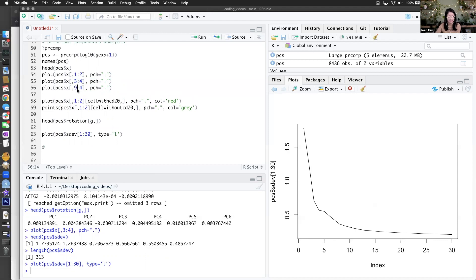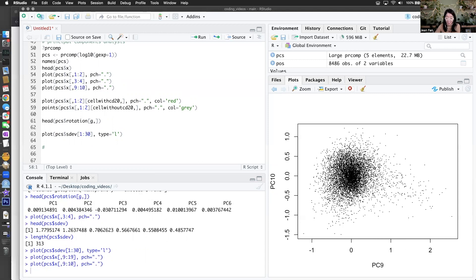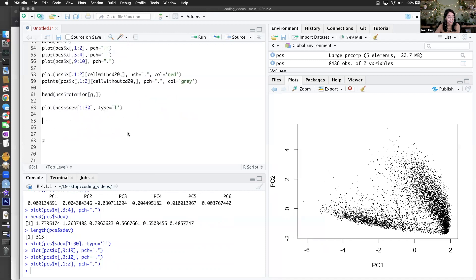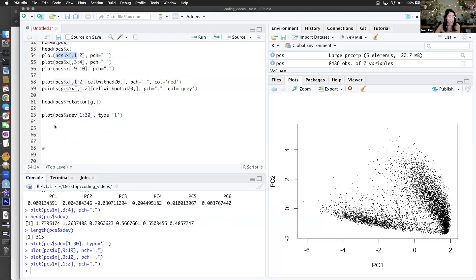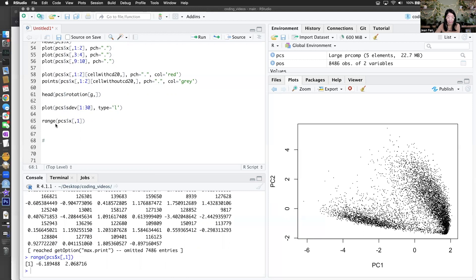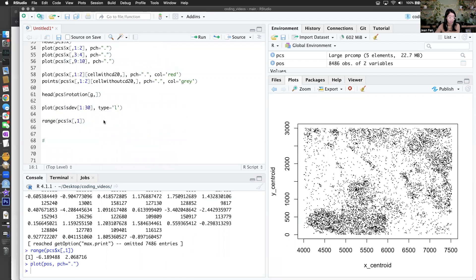I could look through all of them — let's look through the ninth one. Still capturing some variance. I wonder what cells these are. That's a good data visualization question: if I wanted to actually color the cells in space by PC1, how would I do that? Let's try to do that. PC1 has all these numbers — I want to color the cells in space, so I want to make a spatial plot colored by PC1, just to see how the PCs actually correspond in space.